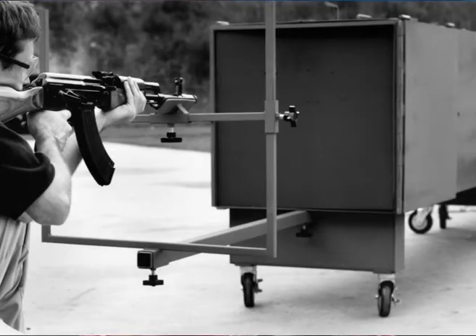Whilst this does not affect the bullet recovery, it is not a pleasant medium to work with. Bleach or a bactericide can be used to remove these algae, but great care must be taken to ensure that the bullet surface is not corroded by whatever is added to the water.